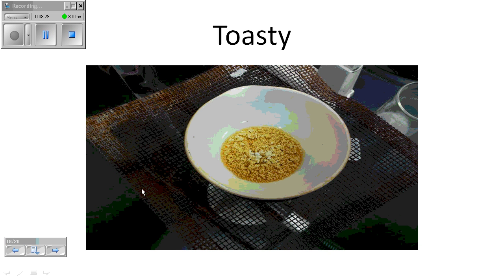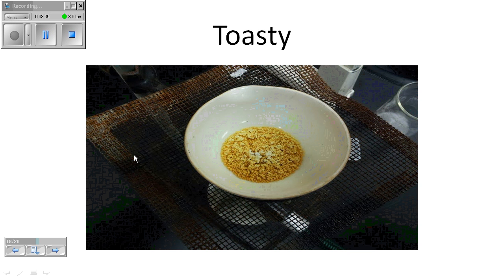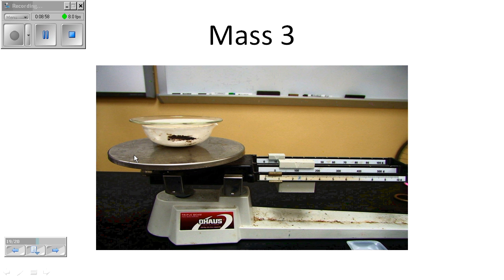And once we start to see that brownish gas, then we know we're starting to get toward the end of the experiment. Okay, so you're going to continue to heat it by the waving method until you start to see this. Now, along the way, if you hear any popping or spattering, you want to take that heat out right away. That's why we're doing it by the waving method, so you can take that heat out right away. So this is what the reaction will look like when it is completely done and completely dry. It says in the instructions that you should try to get a mass of this the third time, and that you should try to heat it again. It is very likely that we will not have the time to heat it for another time, and we'll have to go with this particular mass. Now, if you've done a good job of drying it, that should be fine.